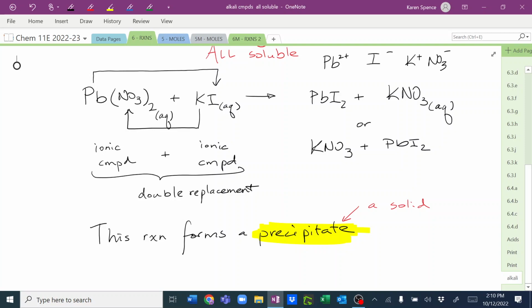And if I pour this one out now, do you guys know what it's called when you pour off a liquid and leave the solid behind? It's called decanting. Is that why it's called a decanter with the wine? That's why it's called a decanter with the wine. Because it used to be, when they made wine, there would actually be some of the yeast and stuff left in the bottle. And so you didn't want it there. So you would decant the wine into the decanter so that you would leave all those dregs behind. The decanter, it's a jug that you put your wine in.